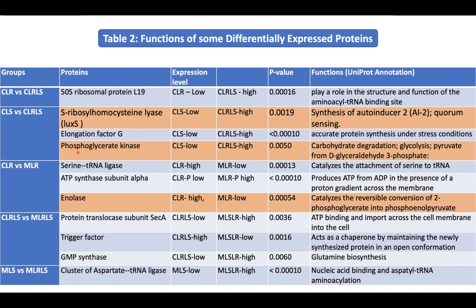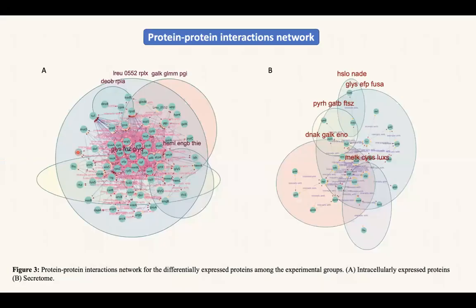That was why I said I was going to leave that pathway and come back to it, because it is interwoven. Until I analyzed the proteomics data, I never fully appreciated the metabolomics data alone. Another important protein is enolase. This table is a very large one, but just for the sake of presentation, I normally highlight only a few, because we all know how large metabolomics and proteomics data are.